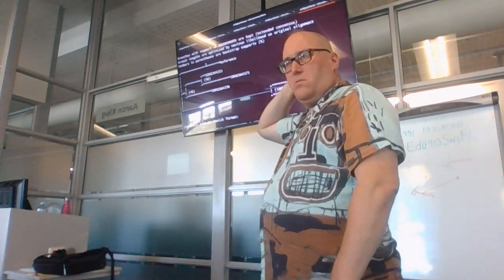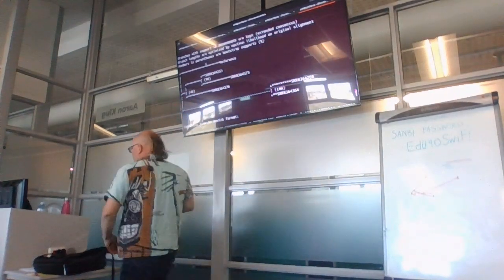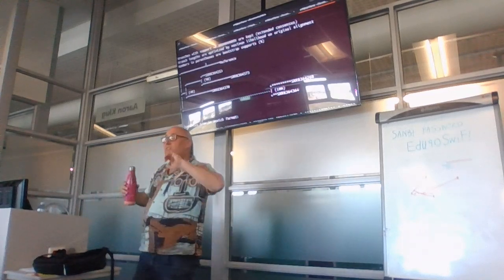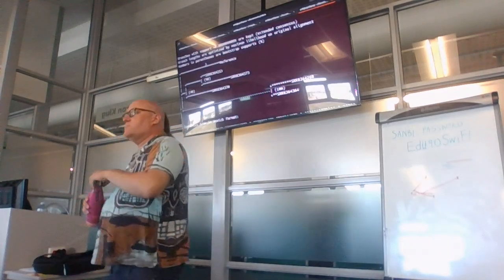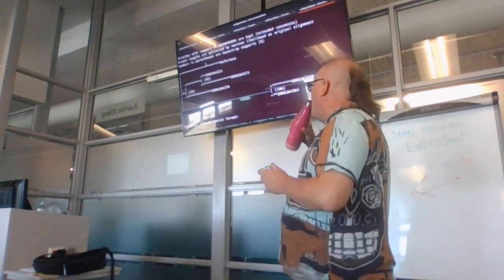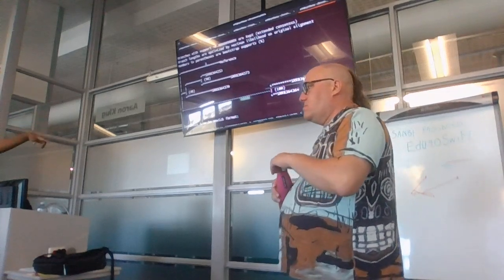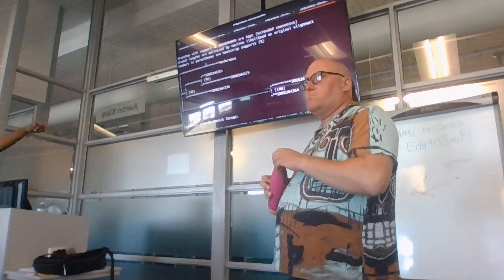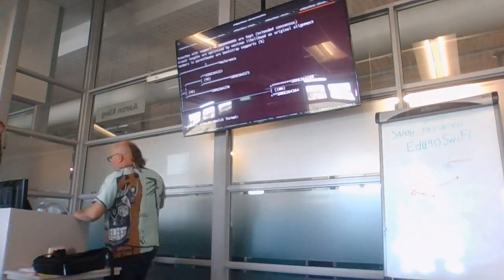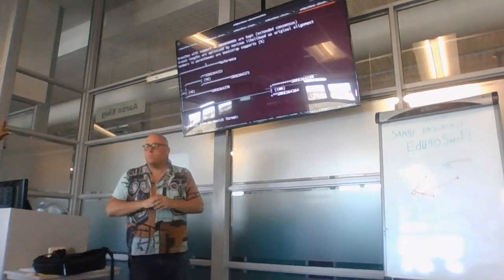I don't know. I think it will change because the other one is much older. So the lengths can change, but will the shape change? The shape might not change. It will not change. Okay? Because the relatedness here between these samples, they're still maintained because they are from the same outbreak. And the only reason we're using the reference is for us to be able to align these sequences against something. So that's why it's in there.